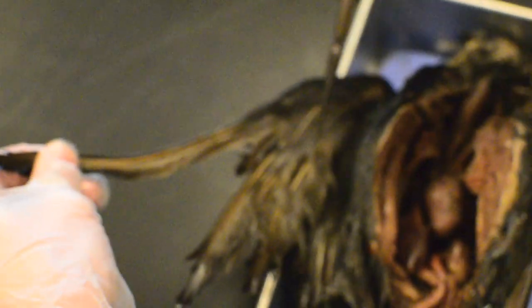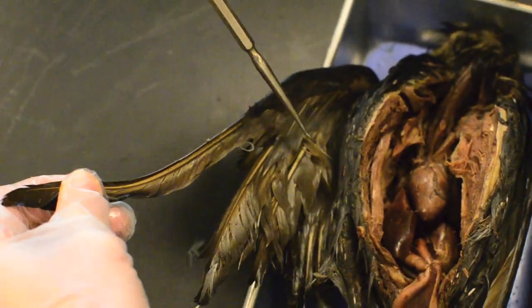Here's the esophagus. Primary feathers come out to a point, secondary feathers are underneath. These are the talons, and here is the beak.